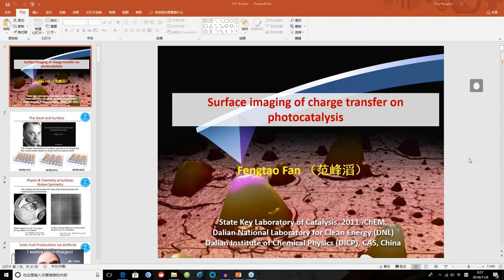I see a number of you have asked about the SPV images and graphs. Professor Fan, you've shown a lot of beautiful SPV images and data. Participants are asking, can you speak about the spatial resolution and the energy resolution you obtain with SPV?